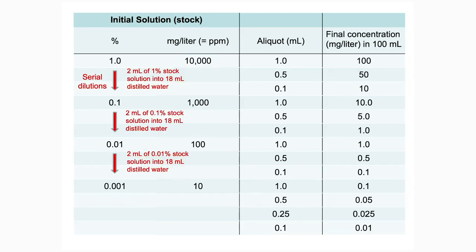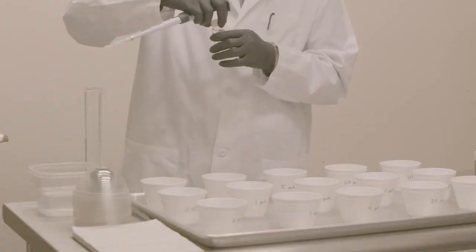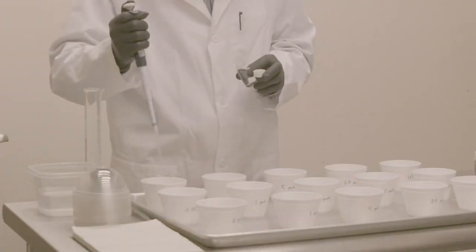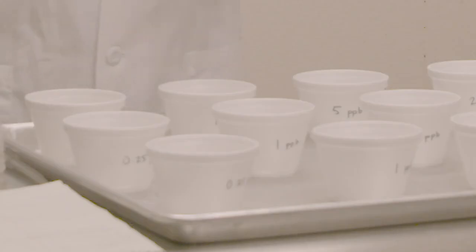100 to 1,000 microliters of diluted stock solution are added to 100 ml of water in replicate bioassay cups. Quite often, the treatment concentrations do not go on a 10 times scale, particularly for pesticides with acute toxicity. A smaller range of concentrations of control agent is typically required.